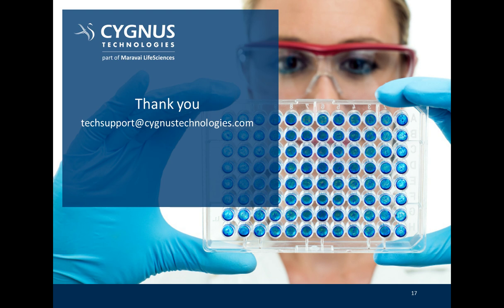So, well, that's kind of getting into some of the proprietary parts of how we do AAE. So I'm not so sure that I can get into some details on that one, actually. Okay. And do you do both intact protein MS and peptide mapping? We do intact.